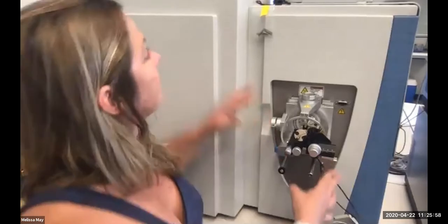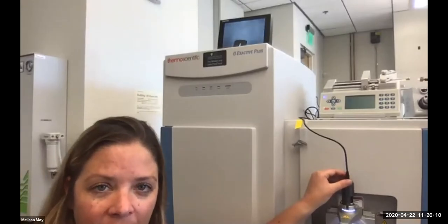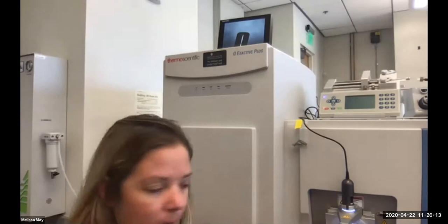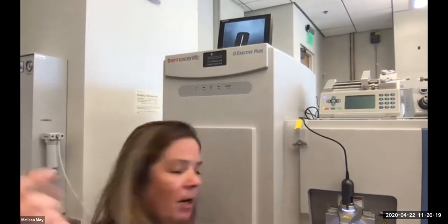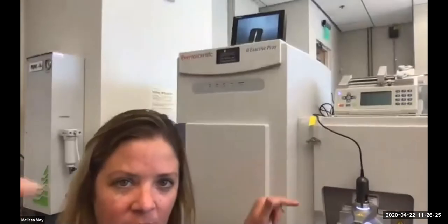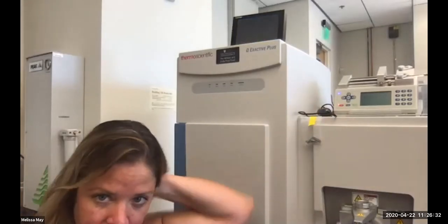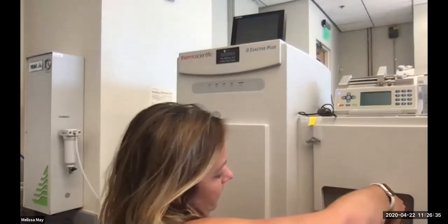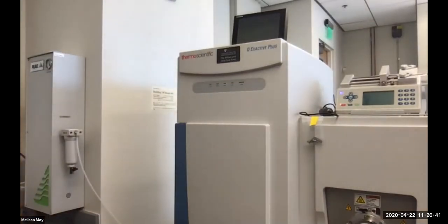This nano source has the additional capacity to have a camera hooked up to it. You can see up above me, I can look at the position. This is my ion transfer tube, the tip of it where I'm spraying into the instrument, and you can look at the alignment of your needle in relation to that. That's just a quick overview of the different sources that we have.